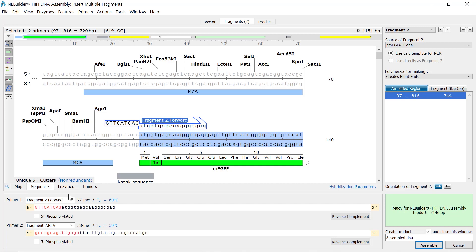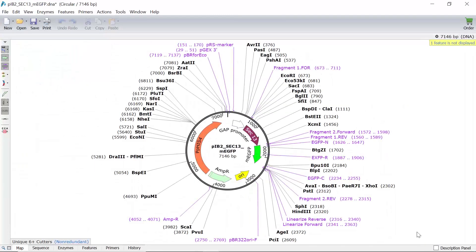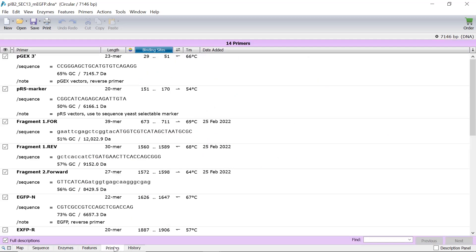Once happy, give the product file a suitable name and click assemble to create the new file. In the new file, you can switch to the primers tab to learn more about the newly designed primers.